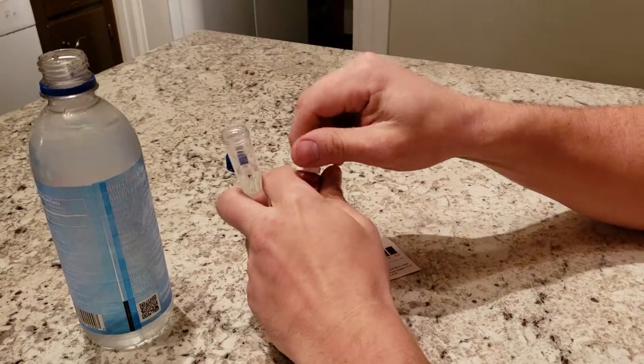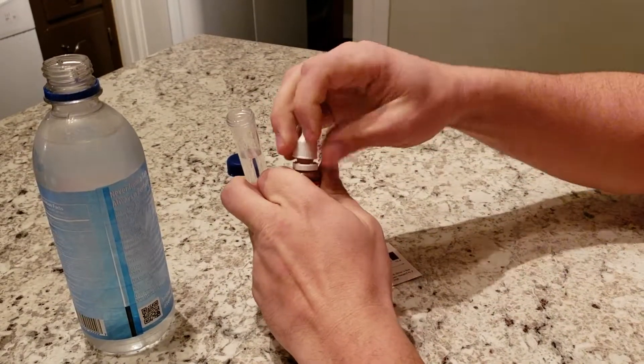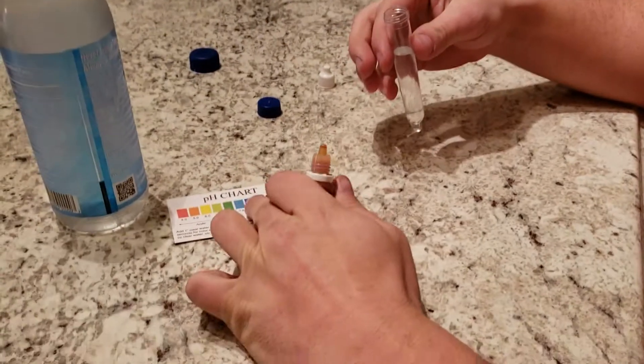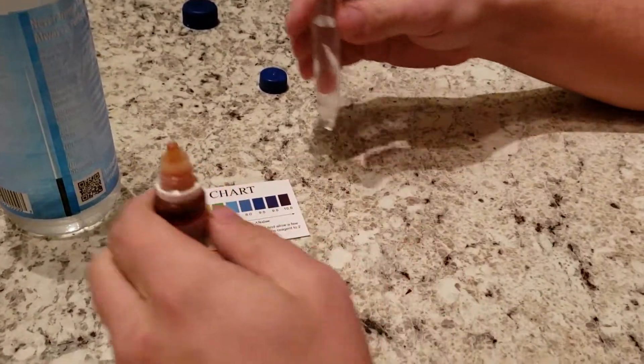Two ounces of water. Four drops of reagent. These are the colors we're looking for. The closer we are up here, the better off we are.